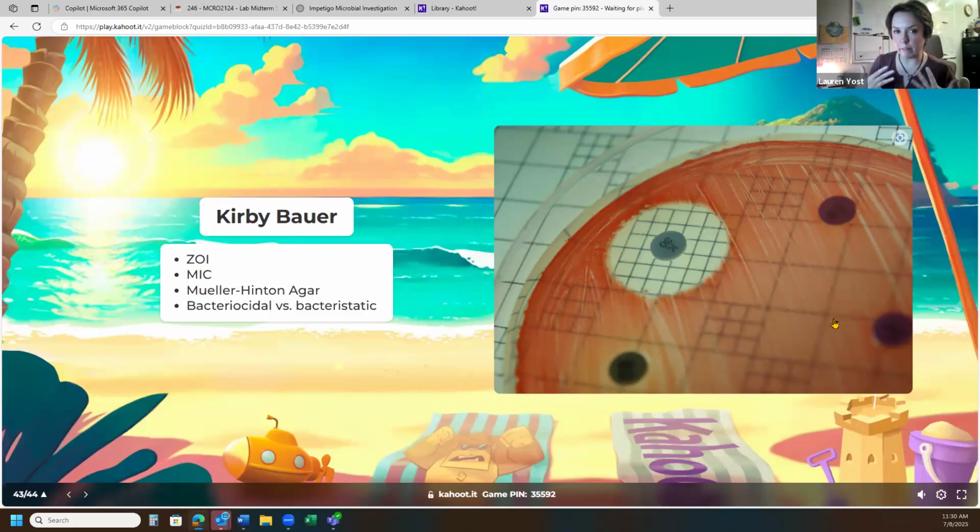It's just a more controlled environment to control that diffusion of that antibiotic as well as the stability of the antibiotic. And know the difference between bactericidal and bacteriostatic and how you would determine that from the assay or steps that follow this particular assay. So this is the Kirby-Bauer assay where we have the actual zone of inhibition. The next step that we did after that is where we determine if it's bactericidal or bacteriostatic. Unless you do that second step, you can't tell from the Kirby-Bauer assay.